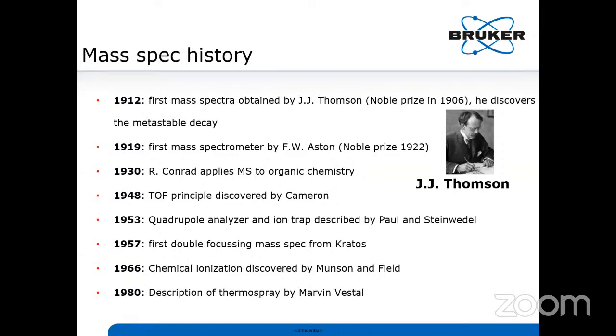Previously, mass spec started as GC-MS. Then, due to the increase in our requirement, the compound mass increased from 1000 to 2000, 3000, 10,000. Now we regularly analyze 150,000, nothing but our mAbs, antibodies. Based upon our requirement, improvement automatically happens in mass spec.